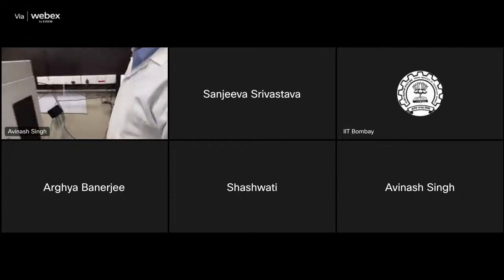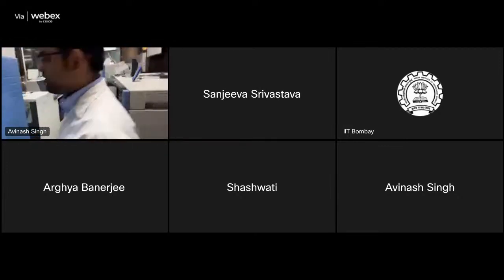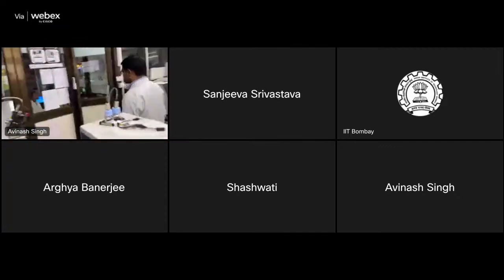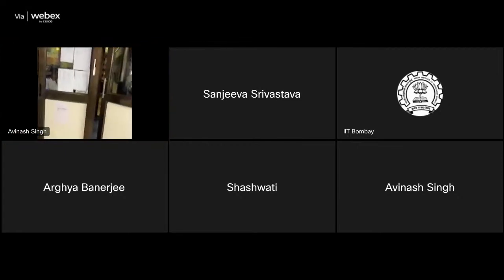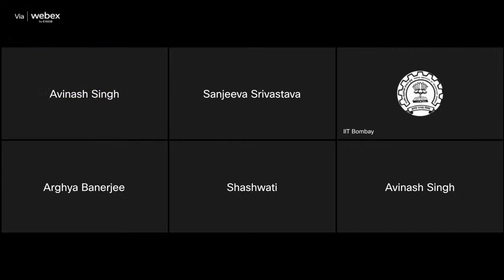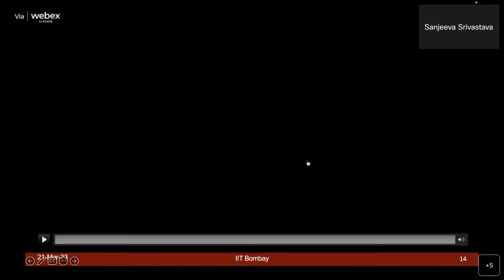Now I would like to request Professor Sanjeeva to take it forward. All right, thank you, Argyo. Now I think students have got a live glimpse of the instrumentation. But this process of acquiring mass spec data requires some instrument method setup. So let me play this video clip of Argyo showing the instrument method setup.